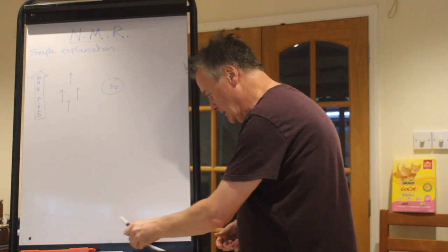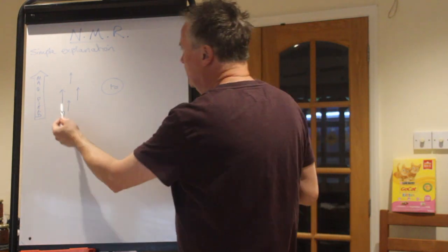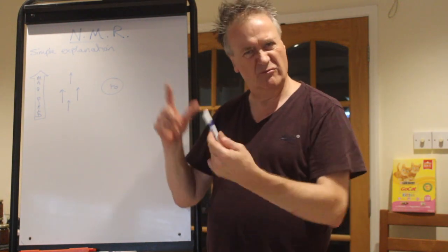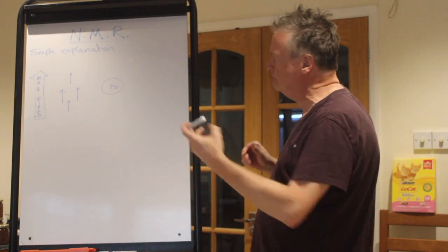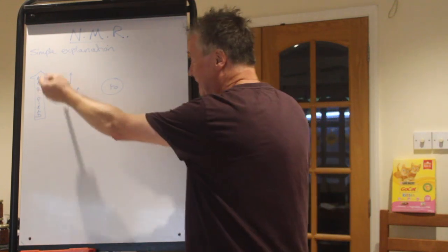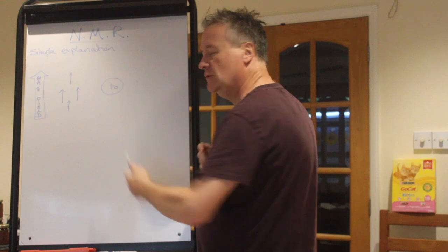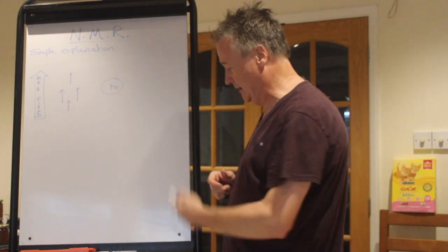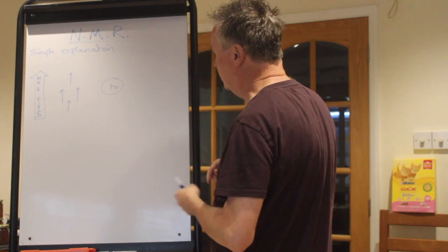So when you talk about NMR, you have a big external magnetic field done with coils, electromagnet. Turn the machine off then. Big external magnetic field, and you put your sample in, and the nuclear magnets line up with the magnetic field, a bit like, you know, same sort of idea as the pen really.